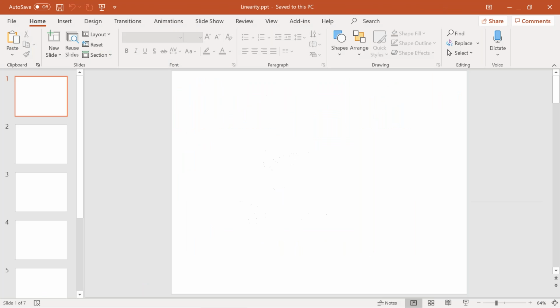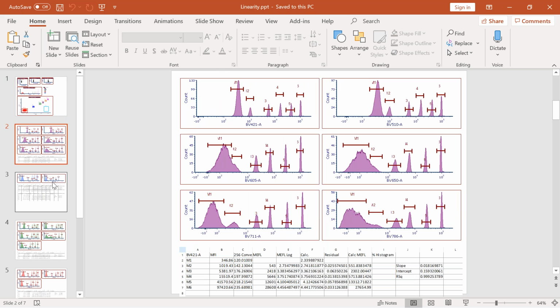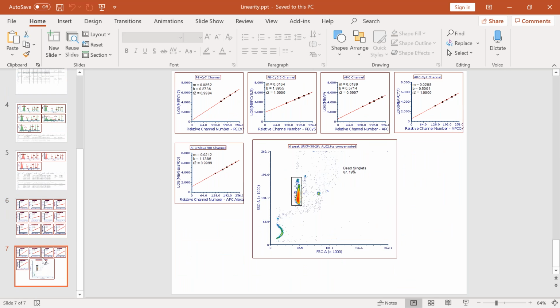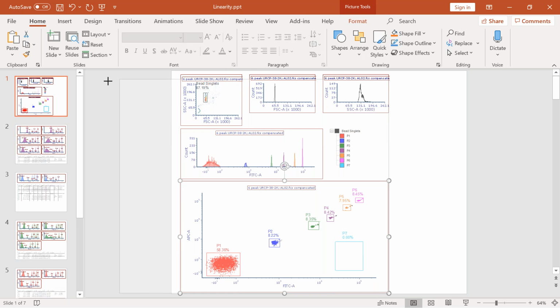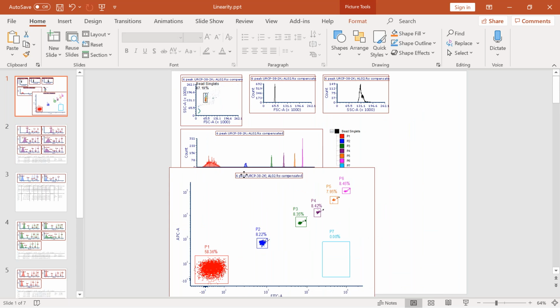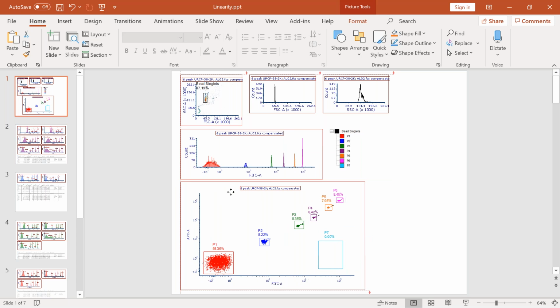It'll put it into a PDF document if you want. And you can see here that PowerPoint has launched. We have all of our information, we have all of our reports, we have all of our regressions. And again, these are super high quality graphics in FCS Express, and they're what's called vector graphics. So you can move and resize and grab and pick and choose what you need to report, whether it be a lab notebook or something for future record keeping.